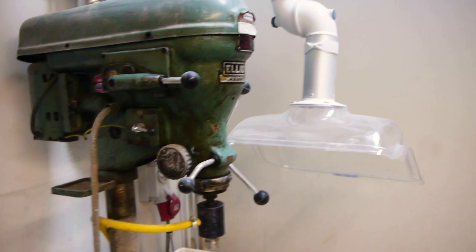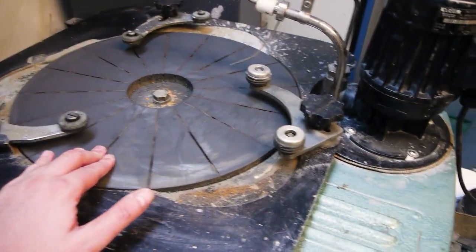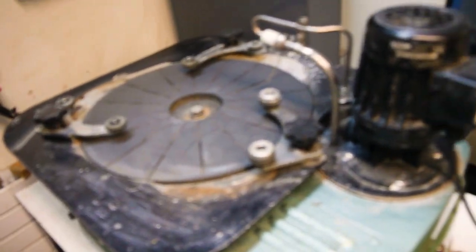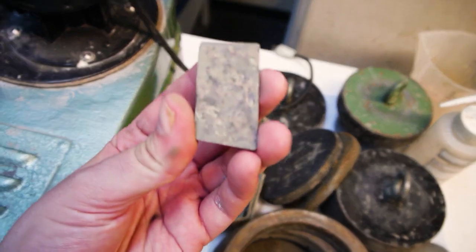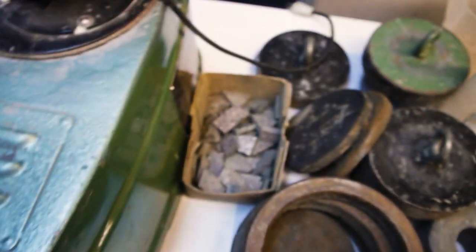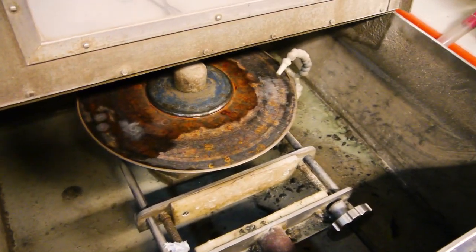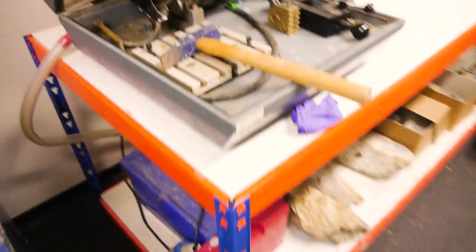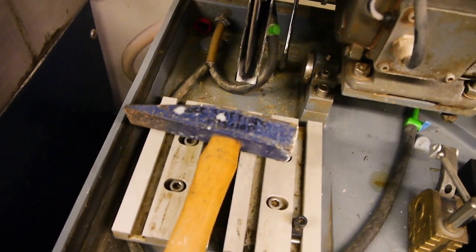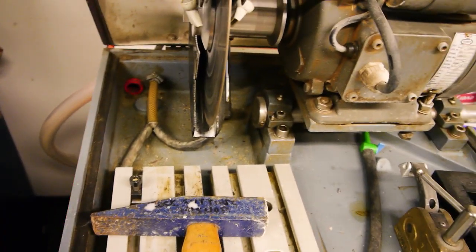Big hefty drill for drilling stuff. And then another lapping machine — just get it fine and smooth. We use these rock chips — there's a bit of granite I think — to pack them in. Another massive hefty diamond saw for chopping up huge thick bits of rock. Always need a hammer in a geology lab. And another diamond saw for chopping up different bits of rock again.